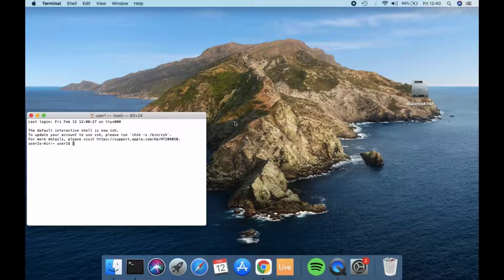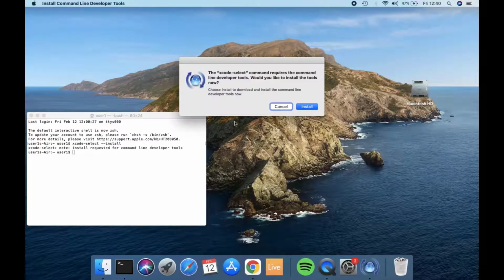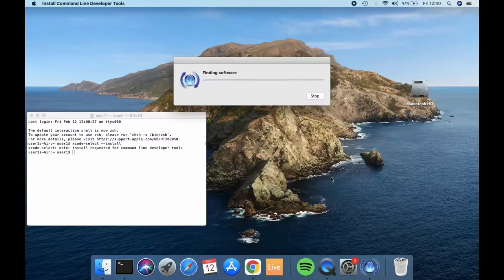and now I'm gonna just install Xcode. So you can type xcode-select --install. All right. And then you have a window that pops up, and you just follow the steps to install it. And it's installing. So again, it's always wrong. I don't know why. Maybe on other computers it doesn't do that. It tells me that it's going to take 1 hour and a half. It's not going to take 1 hour and a half, but a few minutes. So I'm going to speed up the video so you don't have to wait for the entire installation.